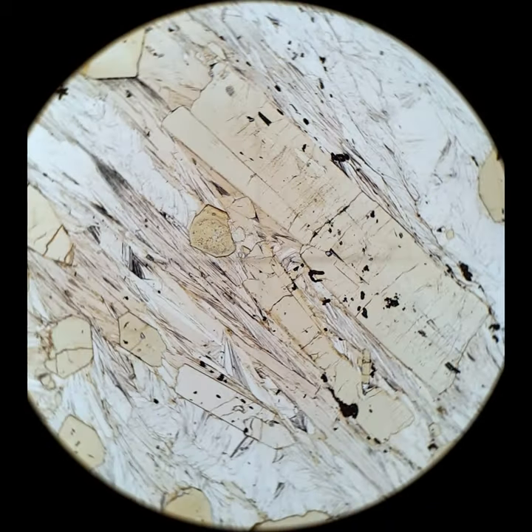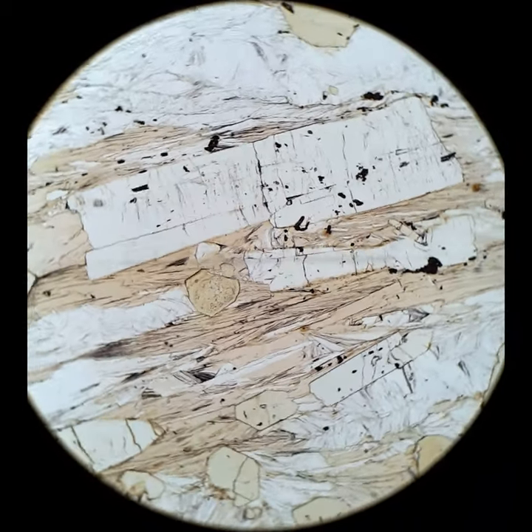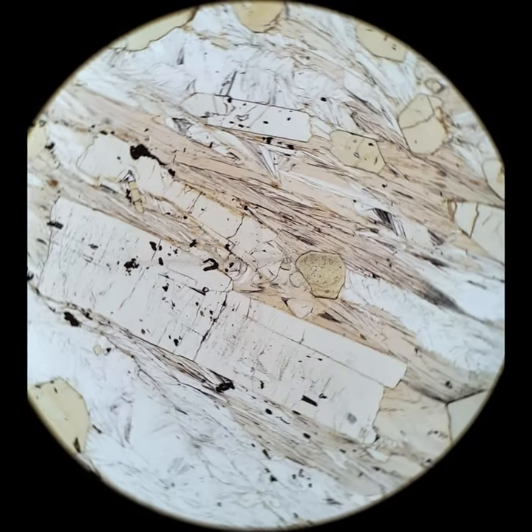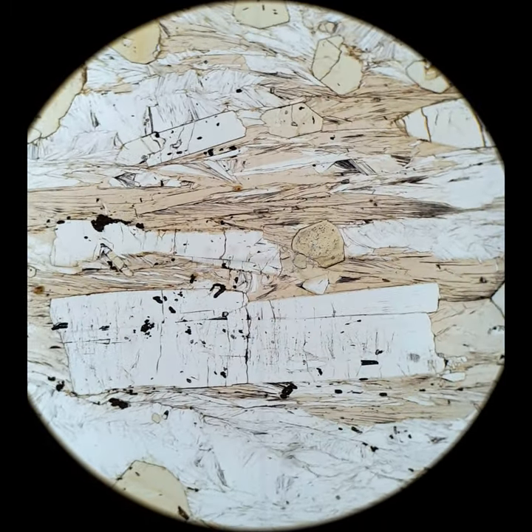That's different from tourmaline, which has reverse pleochroism. When the long axis of the biotite grains are running east-west, biotite is darkest. But when tourmaline's long axis of the grain is running north-south, it is darkest. It's the reverse of biotite, so we call it reverse pleochroism.